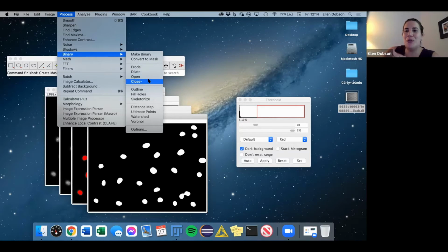I don't remember which one's which, but one is an erode followed by a dilate and the other is a dilate followed by an erode. Those really help with quickly smoothing out sharp edges and small structures on your objects. There's also fill holes. It does just that. If you have a donut structure, it'll fill in the area in the center with a value of 255.